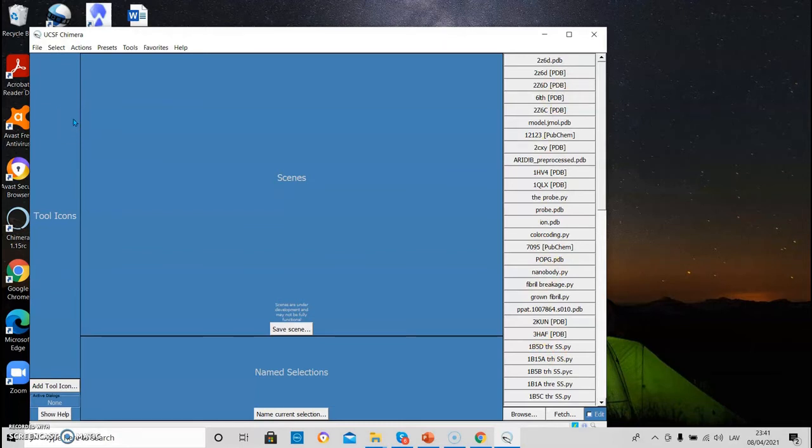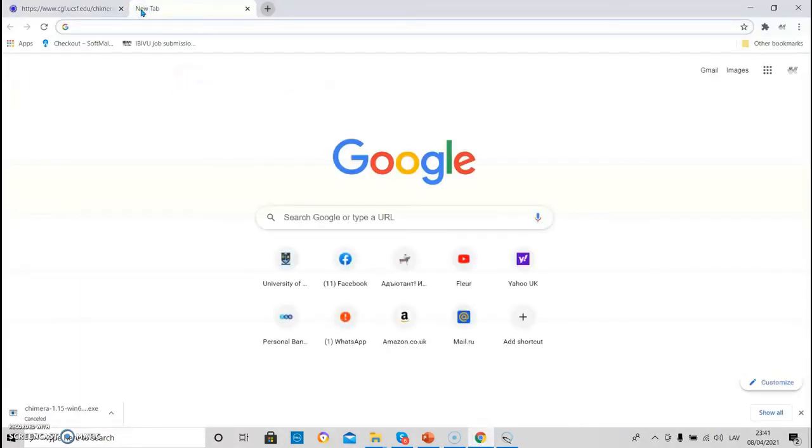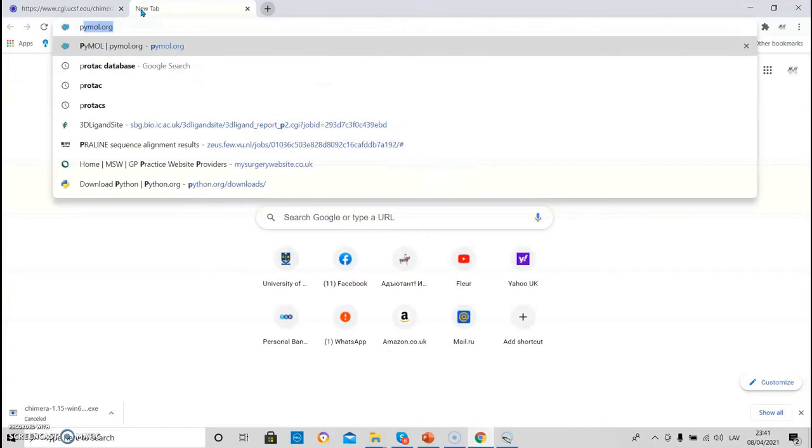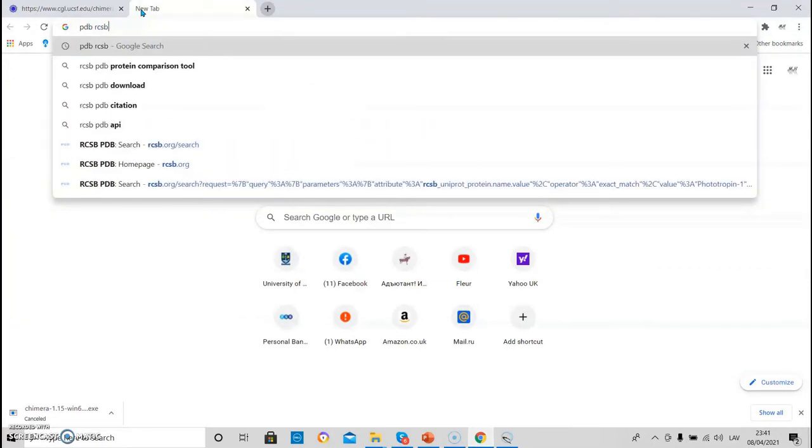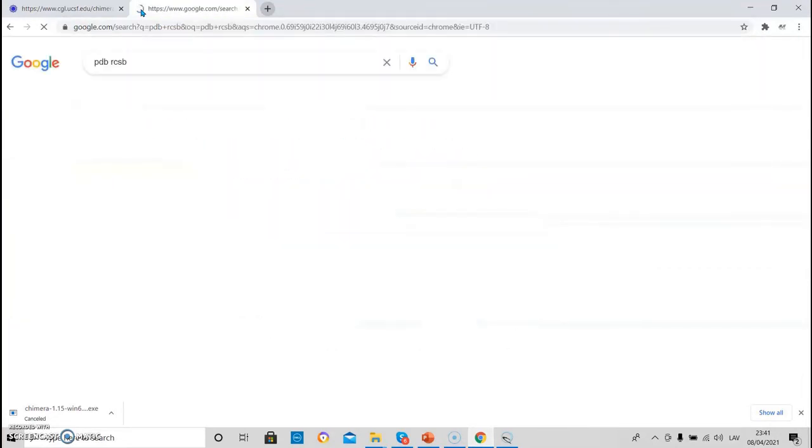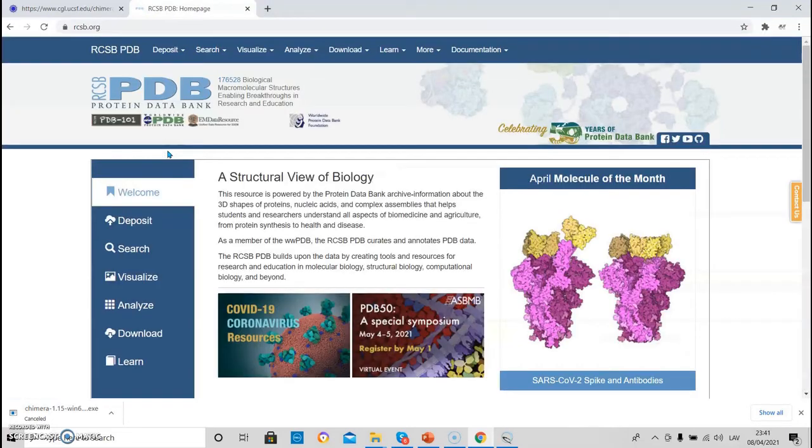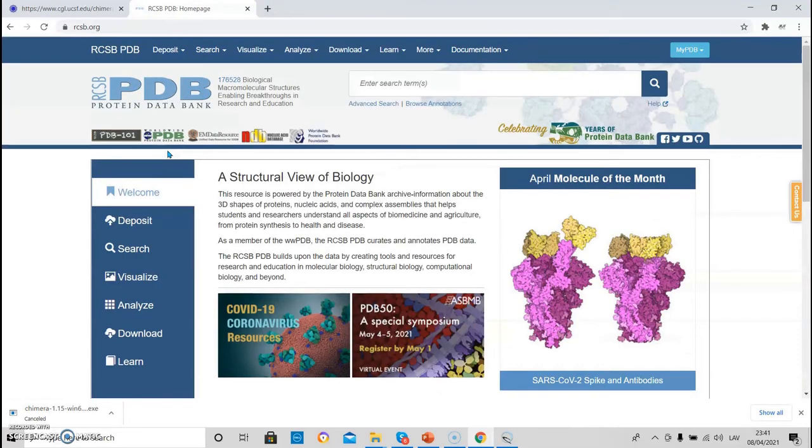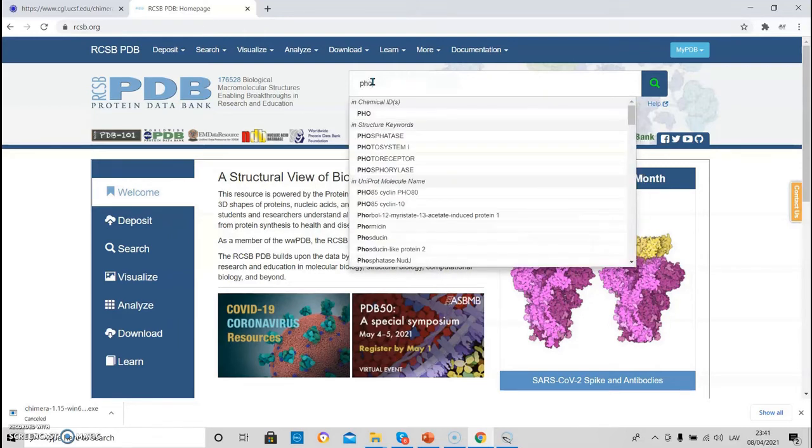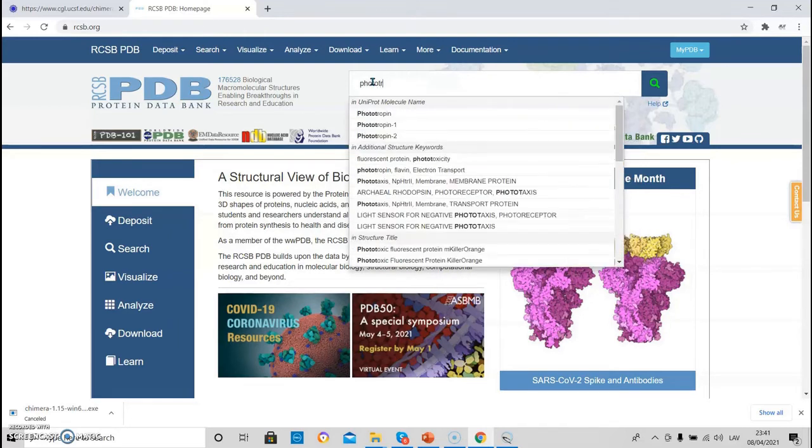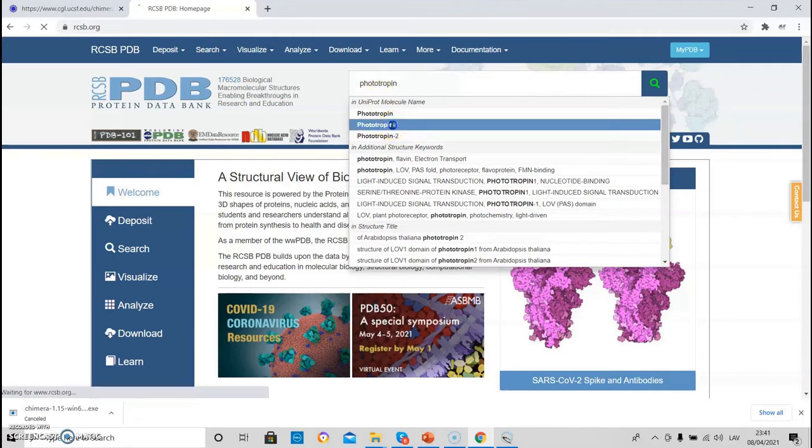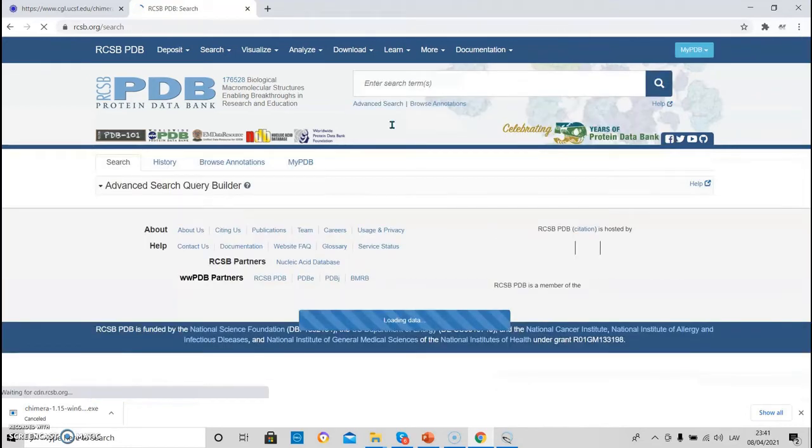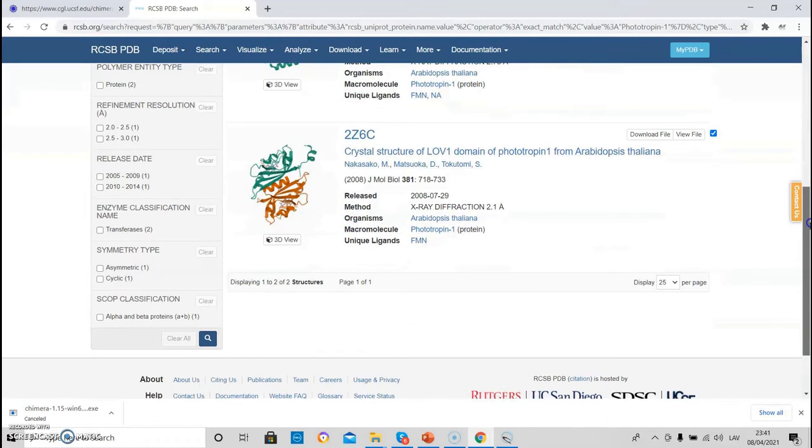Okay, let's load our very first PDB structure. And for that we need to go to the PDB RCSB databank, which is here. Let's Google for the protein of interest, which in our case is phototropin one. And we can choose the PDB structure which we like. For example, this one.